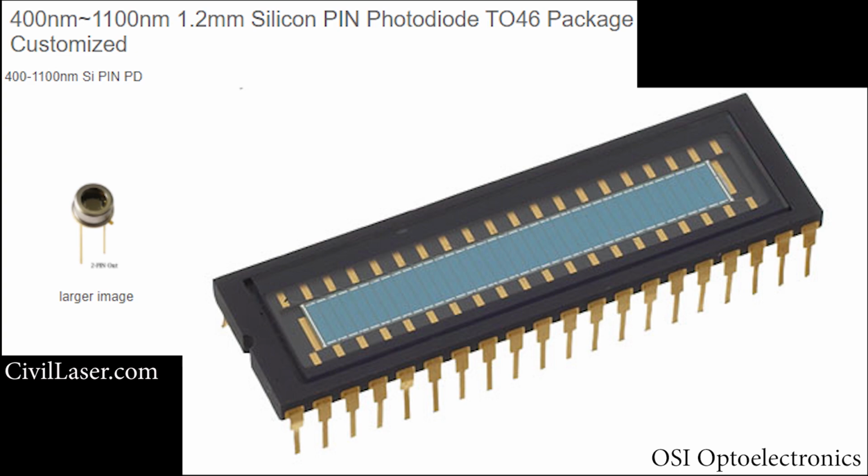But there's definitely a discrete number of detectors. There's a discrete number of diodes you have to know. And that's going to limit your resolution because I have 2,000 photodiodes, so I essentially have 2,000 pixels. You are not going to get the kind of resolution that you would get in a double beam scanning instrument.